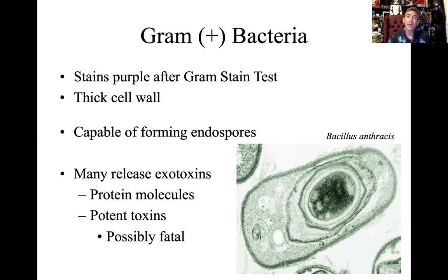So it will be a Gram positive bacteria. Now this is significant because Gram positive, purple staining bacteria will have a very thick cell wall. With a very thick cell wall, we know we're going to have to work hard to break through that big, thick protective barrier. So it's just a big, thick cell wall and nothing else. That's important.